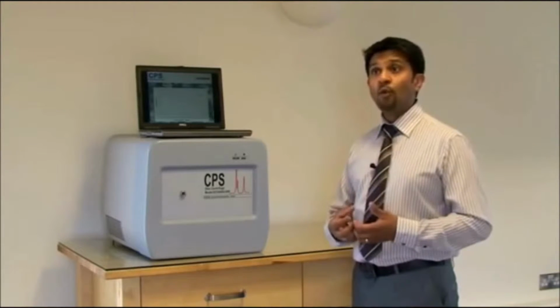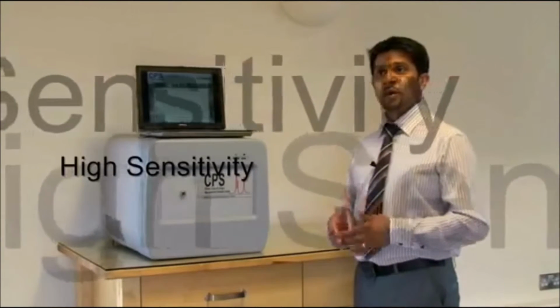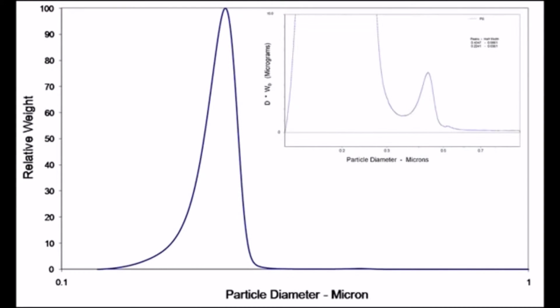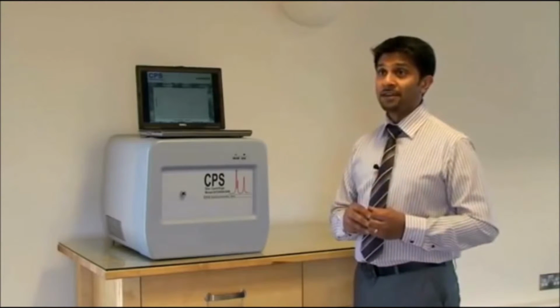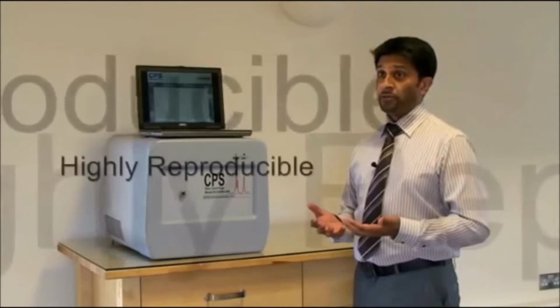The CPS technique is a great technique for looking at very small concentration of material, so it has extremely high sensitivity. In this particular example, we've got a very broad peak, nothing very exciting about this, but if we zoom into the actual trace, we will see that we've got a very small peak at high particle size, which is almost hidden at the baseline, but this peak is real and it's representing a certain percentage of large particles. And in most cases, you'll find that this small peak is more important than the actual main particle sizing peak.